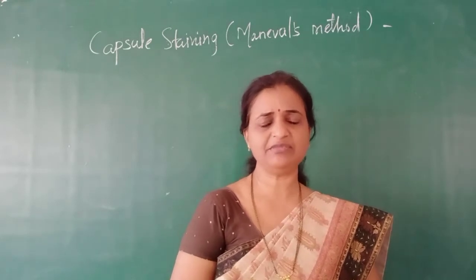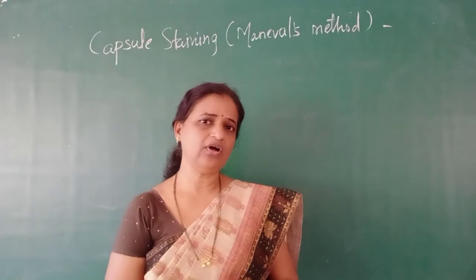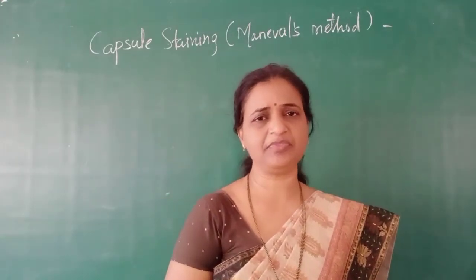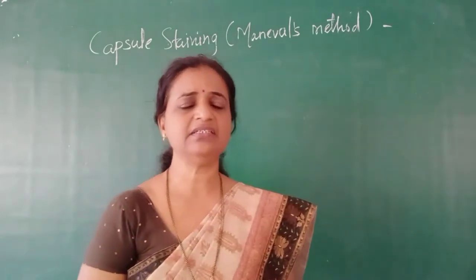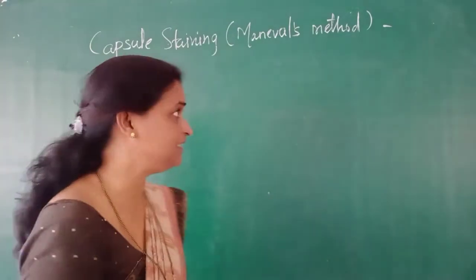It is the Maneval's method. It is the procedure behind the Maneval's method to observe bacterial capsules. Notice the exact mechanism behind the demonstration of bacterial capsules. So let us see the procedure for the demonstration of capsule staining.